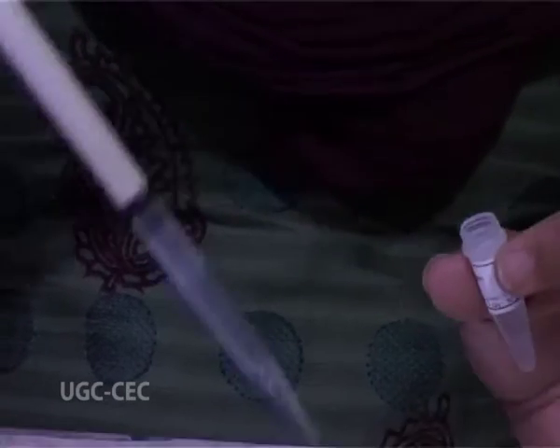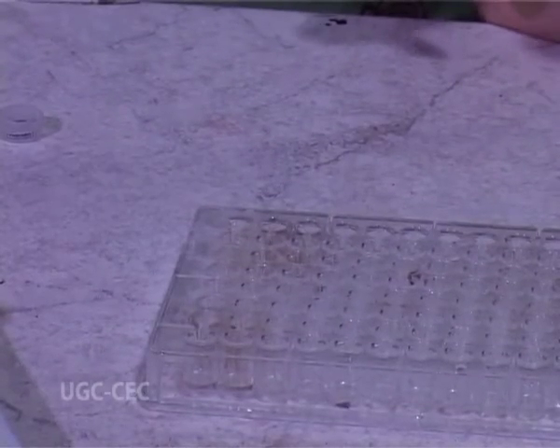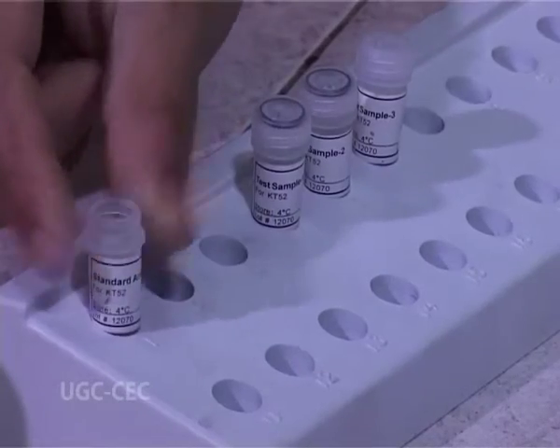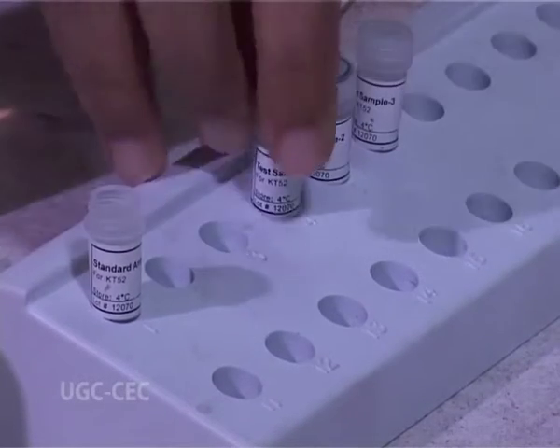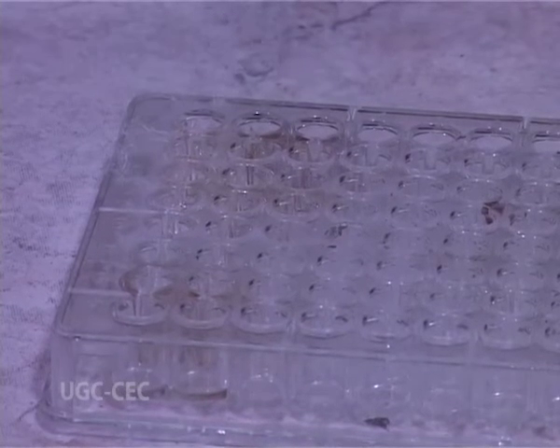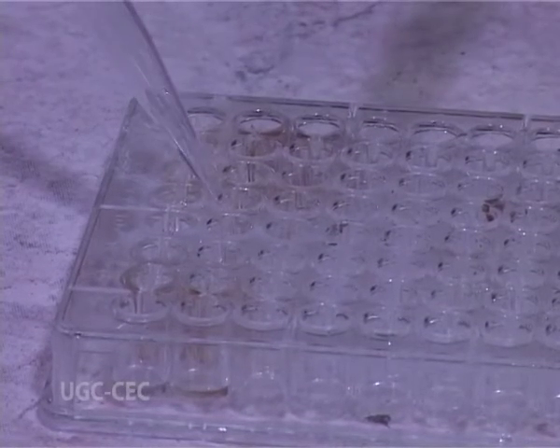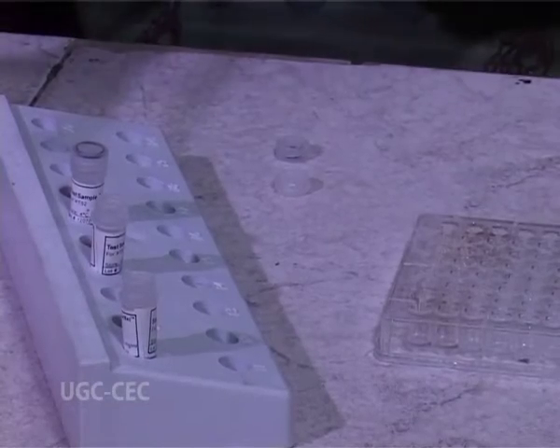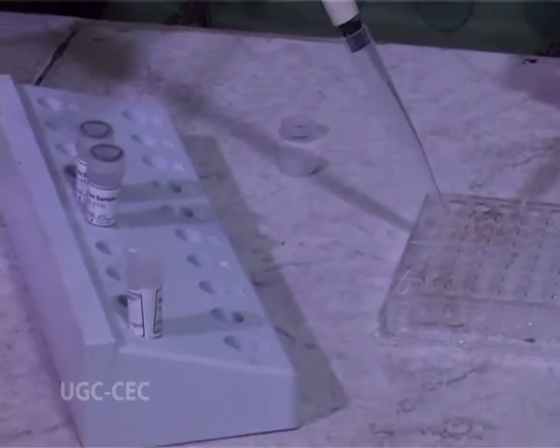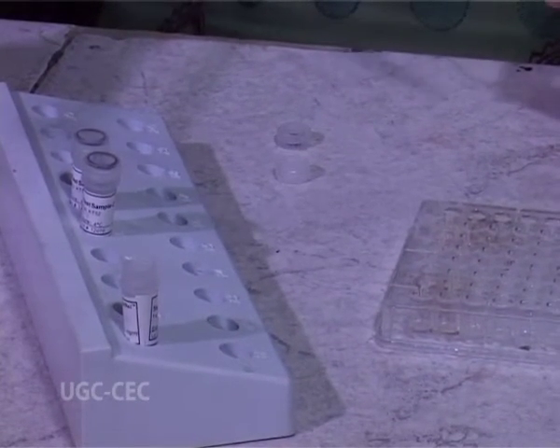This is the simplest of all ELISA techniques. And how can we perform direct ELISA? First we have to add the antigen sample, both standard and test sample, in microtiter wells, and we have to give some time for adsorption of the sample to the microtiter well. Now microtiter wells are made of polystyrene or polycarbonate material, and the antigen which we want to analyze is normally a protein which will bind to the polystyrene or polycarbonate material through non-covalent interactions, mainly through hydrophobic interactions.